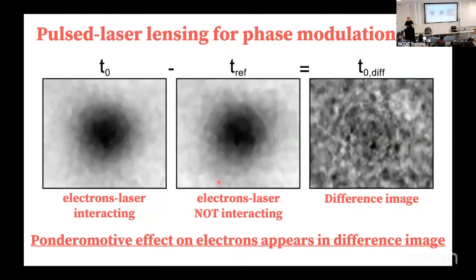And so the big result of the experiment was the following. These are the holes in the hexafoil grids. They obviously look somewhat holy, but we are on the 4th floor in a very bouncy building, and so the resolution is not what we would ideally like, but we can see the holes.